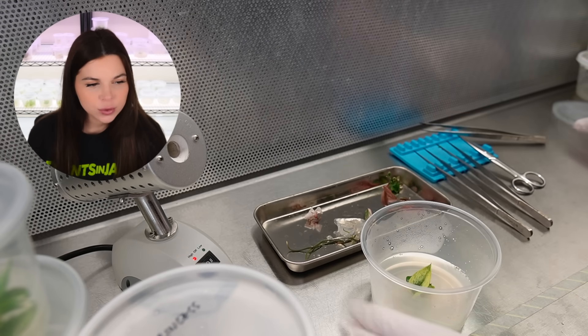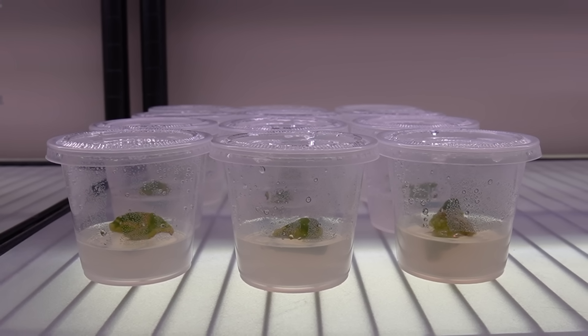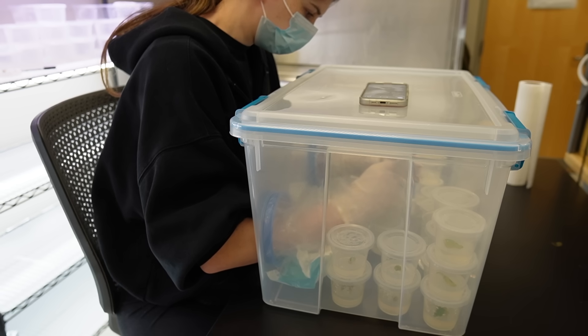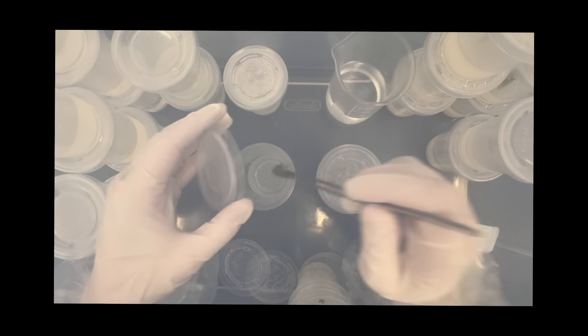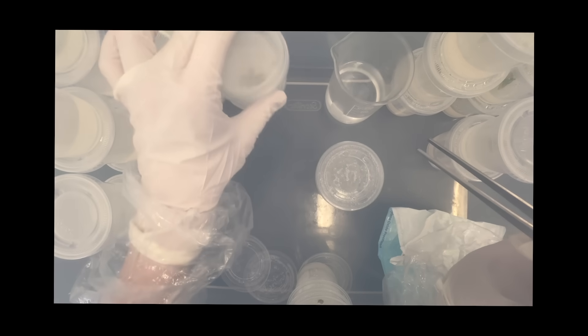I did all of those transfers in the flow hood that you're watching. I'm also working on part two of a video called 'How to Clone a Plant at Home,' where I only use a still air box to clone some African violets from start to finish. For that series, the transfers all need to be done inside a still air box. The goal is to show people that you don't need a ton of expensive equipment to get started with TC — I just want to show that it actually does work.